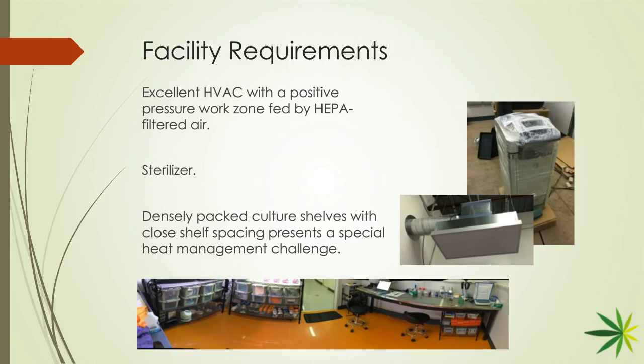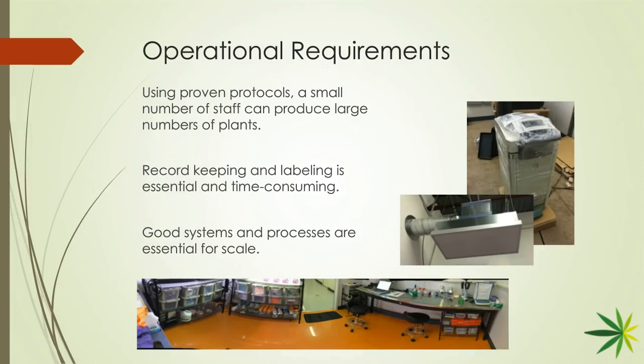Awesome. And so you see the workspace, you see what it takes to get the environmental controls where it's needed. Now the operational requirements, how do we manage this? How do we keep everything in order? How do we not mix up all of these tiny little boxes with all of these different little plantlets they all look identical? How do you manage that?